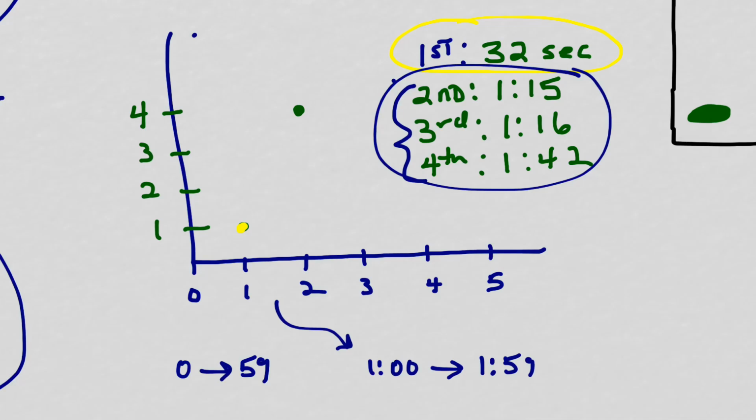So let's pretend that I am tall, which is not really much of pretending. Alright, let's get rid of this. Let's pretend in the 5th minute, or the 5th disk, I'm sorry, these are the number of disks, I had one at 2:30. Let's erase some of these points here that we don't need. So I had another disk. So if you notice, let's say that in the 2 to 3 minute mark, I only had one more disk.